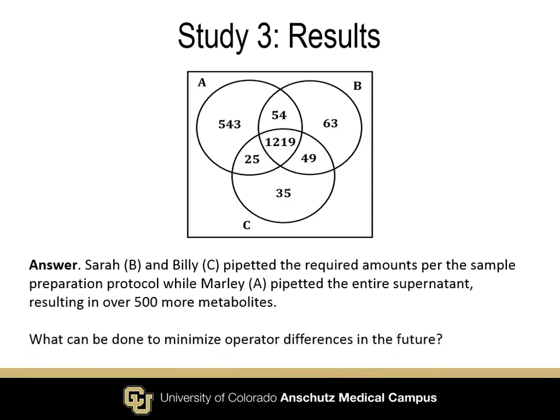So the question is, what can we do to minimize operator differences in the future? And typically, it's having standard operating procedures, which all of us understand help minimize these problems, but also documentation so that we're all performing the same procedure the same way.